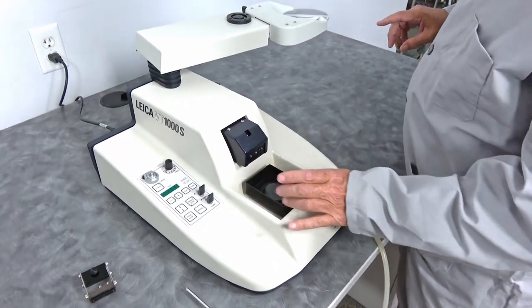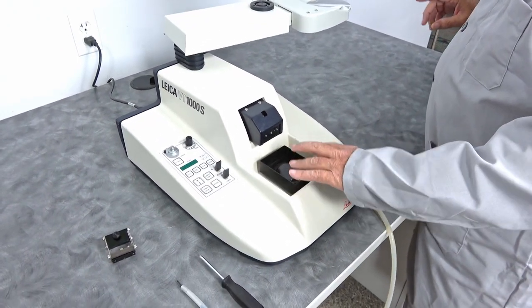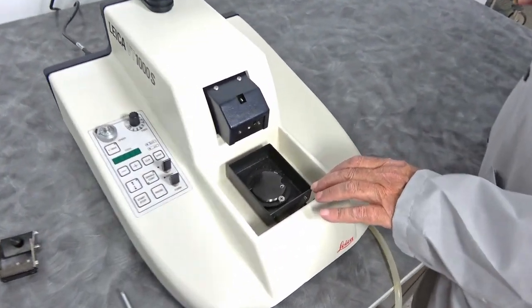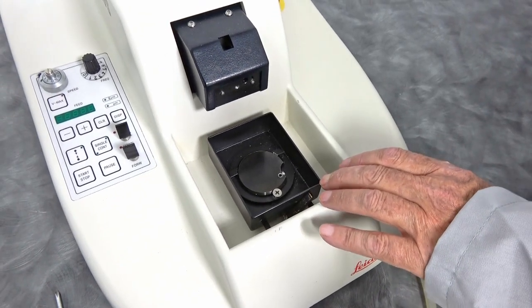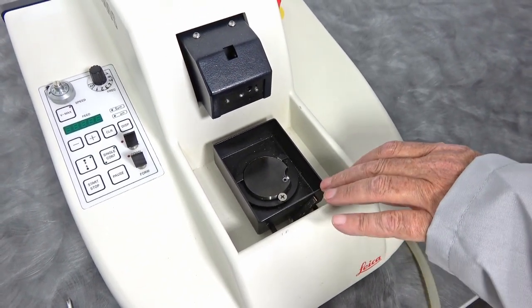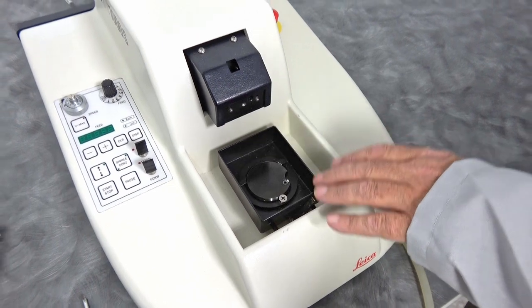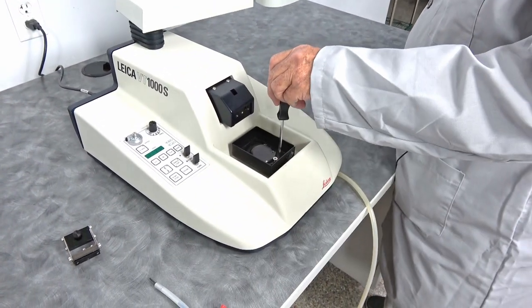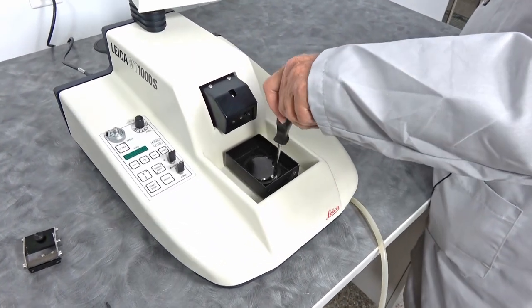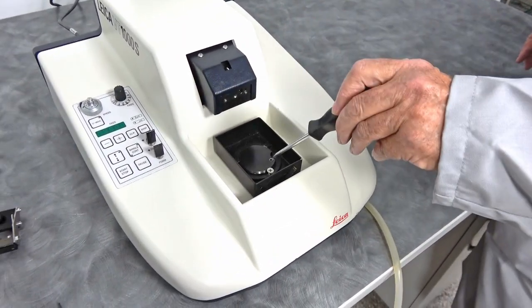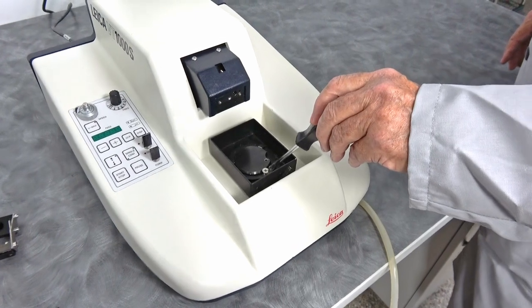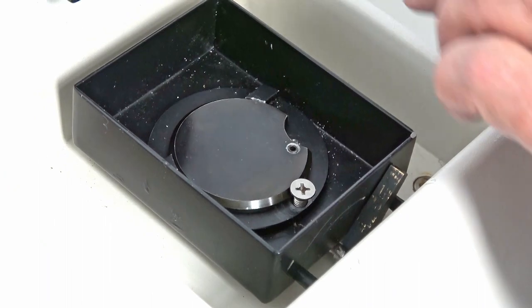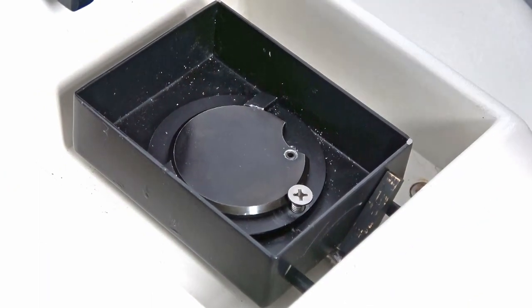Also, we see a lot of these without the tray, the sample tray, probably best called a stage. This one also has the specimen mount. We did substitute a standard screw on this one. When you unscrew that screw, it releases the stage for removal.